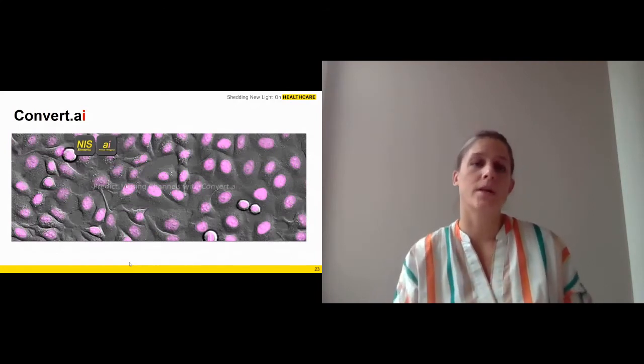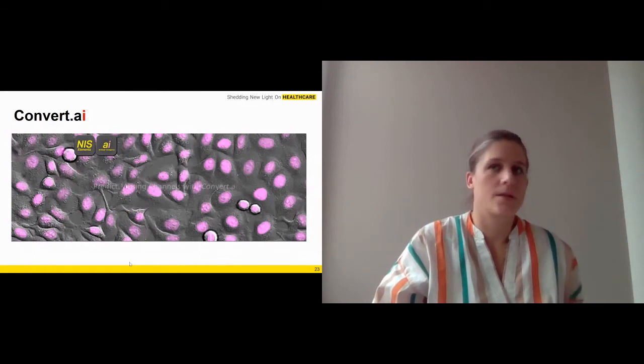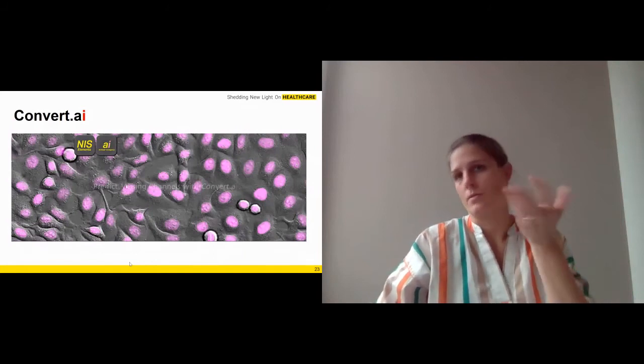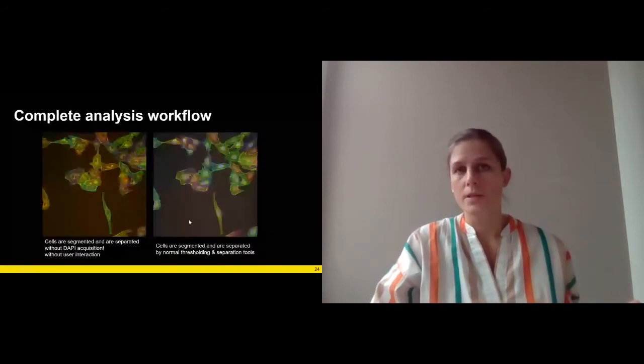And of course, afterwards, you can have a complete analysis workflow. So here on the left, you see there was no DAPI taken. I mean, this is a fixed sample, but even without the DAPI channel, as we have the Convert AI, we can reach the same segmentation we have from the image with the DAPI channel. So it's not really needed. And you could think you just get rid of it.